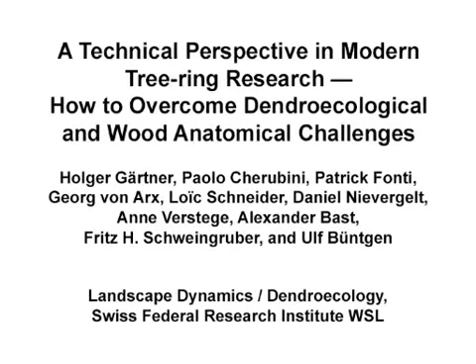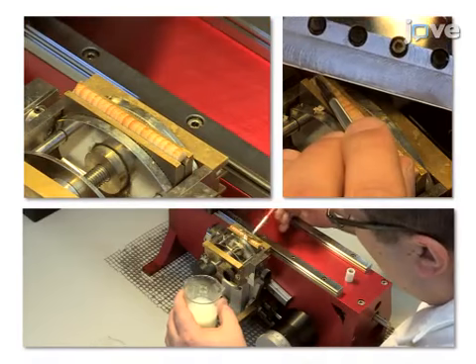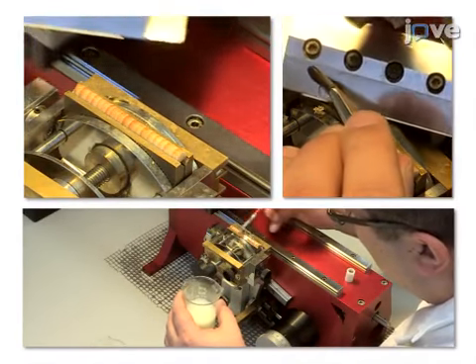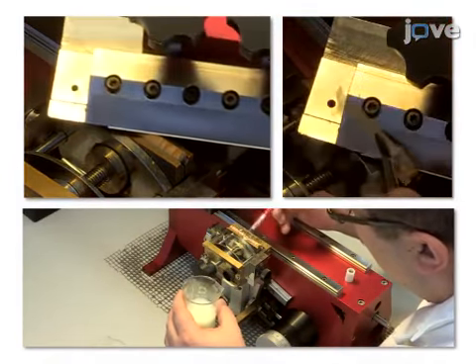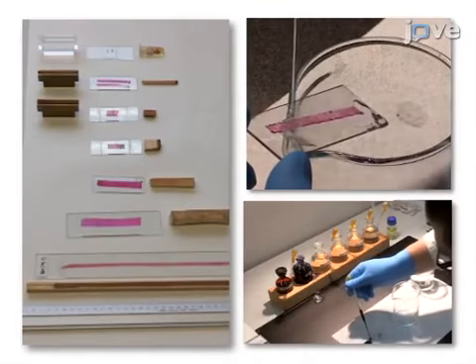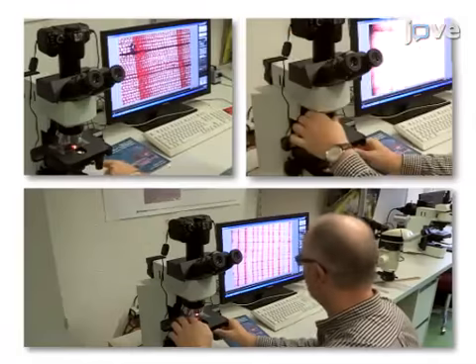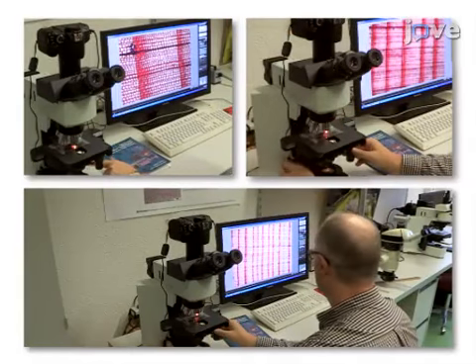The overall goal of the following experiment is to generate well-replicated and highly resolved wood anatomical datasets to study the effects of time and environmental factors on tree and shrub growth. This is achieved by using a non-Newtonian fluid to stabilize the plant cells during microtome sectioning, allowing a detailed microscopic analysis of the samples. As a second step, the microsections are double stained to facilitate the differentiation of the lignified and unlignified cells, and then digital images are taken of the samples.